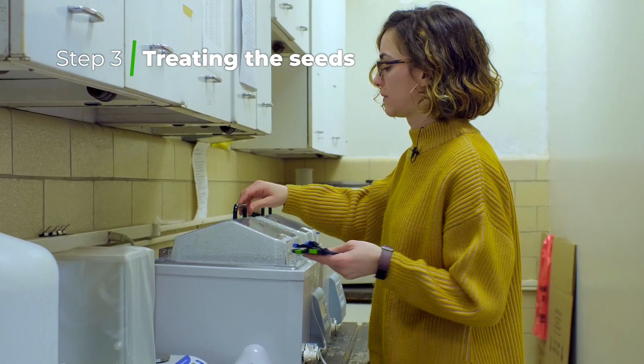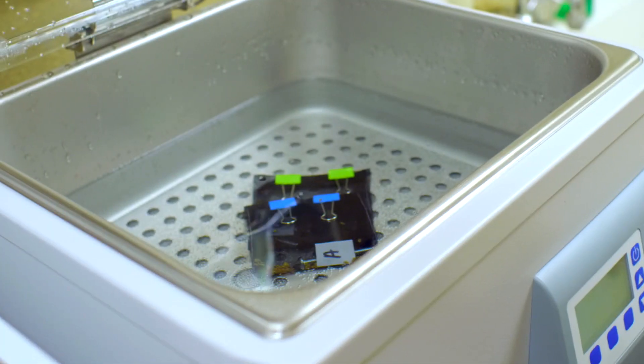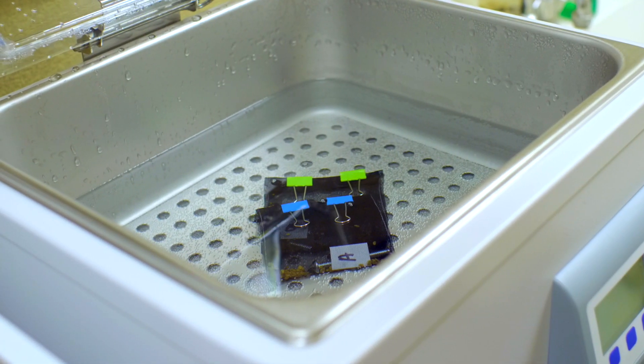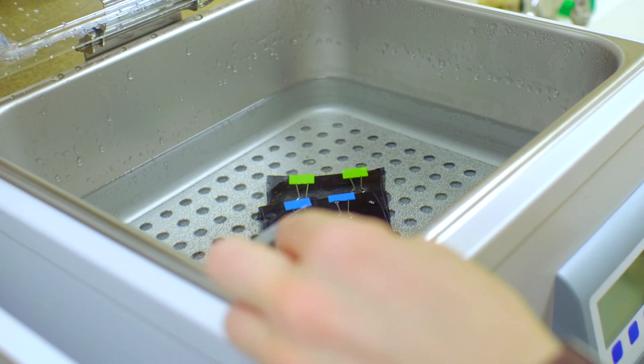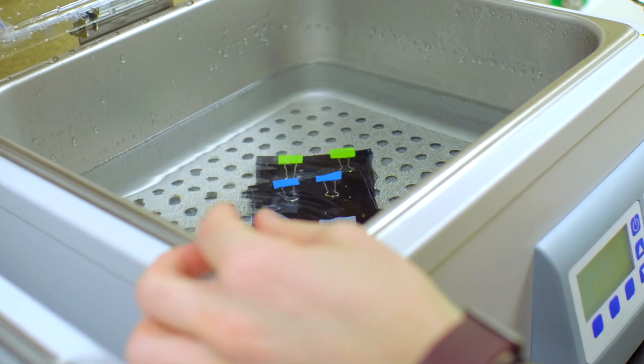Seeds are first treated at 100 degrees Fahrenheit for 10 minutes to initially warm the seeds, and then they're treated at 115 to 128 degrees Fahrenheit for 15 to 30 minutes depending on the crop that we're treating. We use an air bubbler to keep the samples moving during treatment.